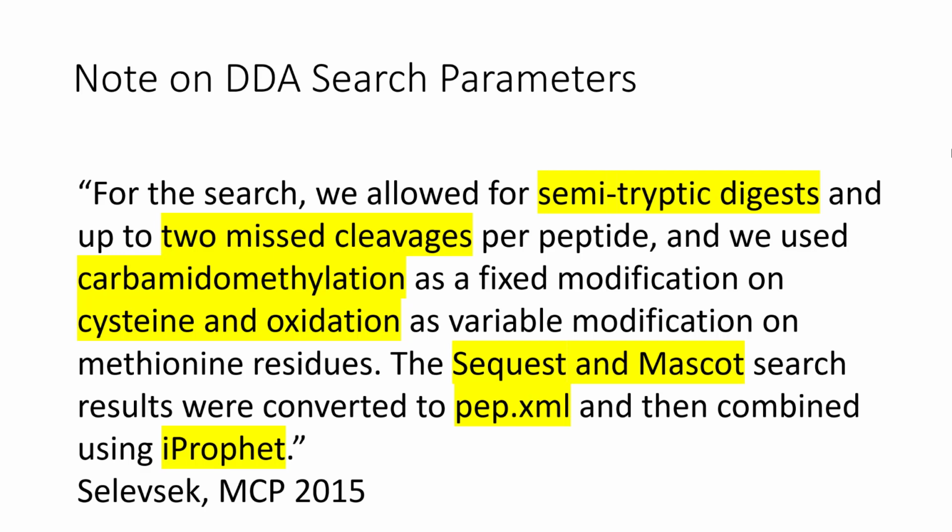So here I pulled out a few sentences from the methods that I think are particularly important. One is that they did their search with semi-tryptic digest. Who knows what a semi-tryptic digest is? Hear from somebody new. What's a semi-tryptic? What does that mean?